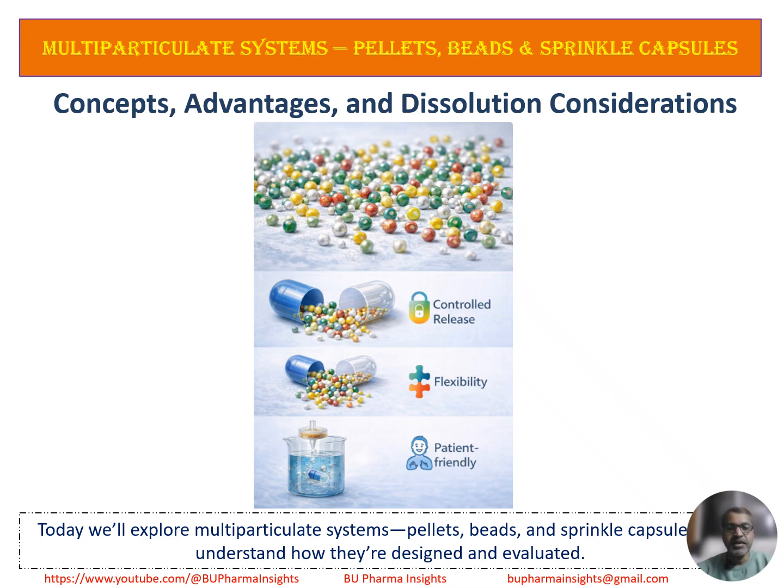However, multiparticulates behave very differently from tablets, both in formulation design and dissolution testing. Each unit releases drug independently, so their hydrodynamics, floating behavior, and release patterns are more complex. That's why multiparticulates require a different testing mindset.